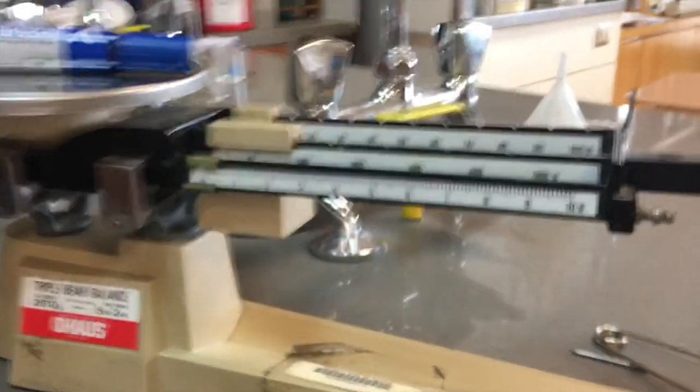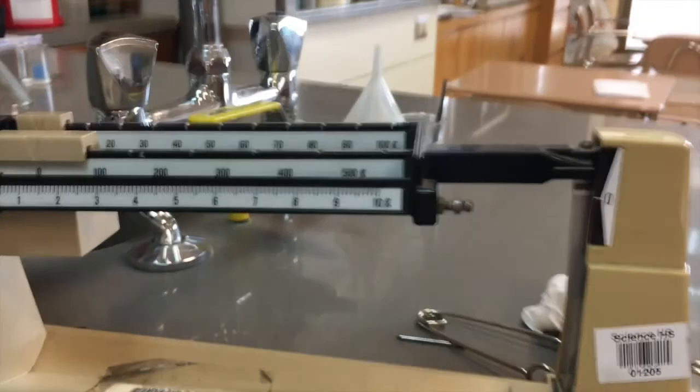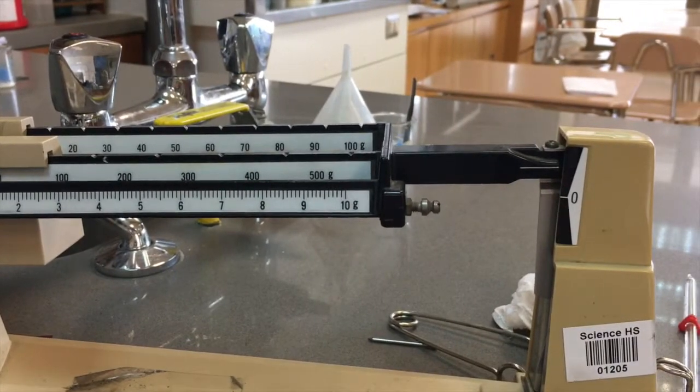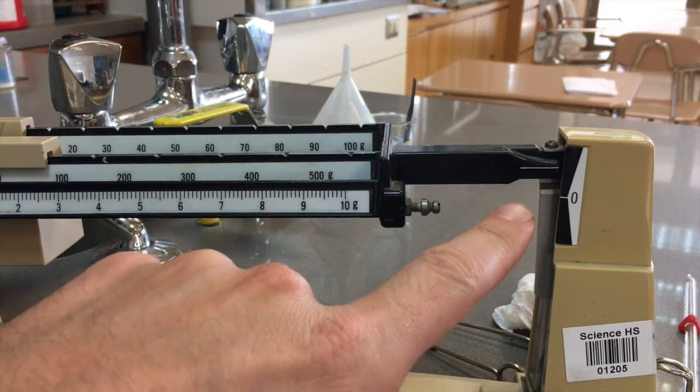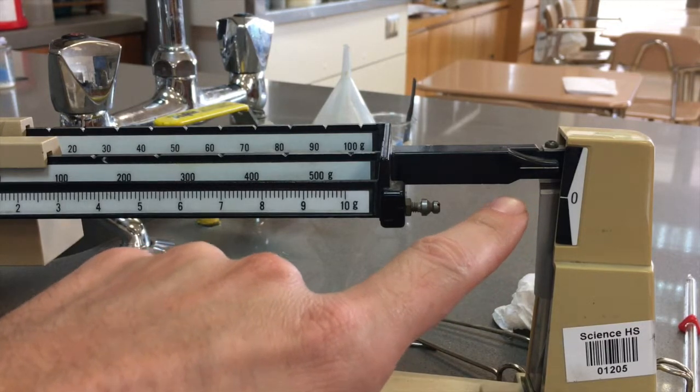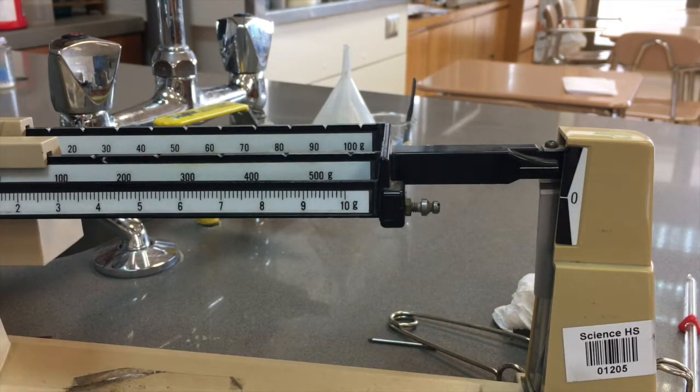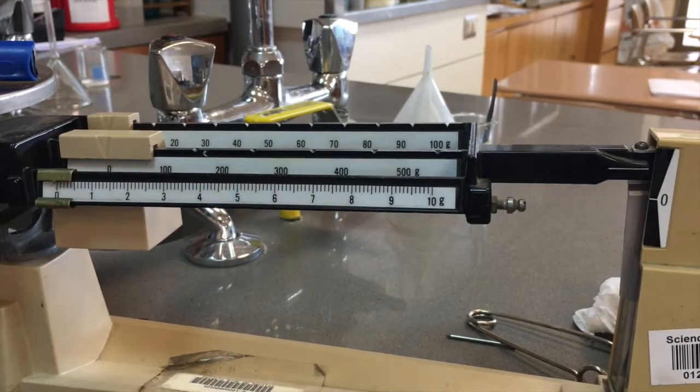And then you can see that, if I pan over here, excuse the pun, you can see that the lines here are not matching up. Your goal is to match up those two lines, and you do that by sliding the sliders over.